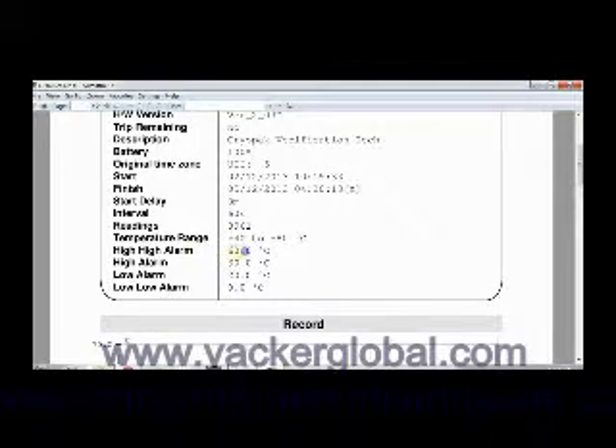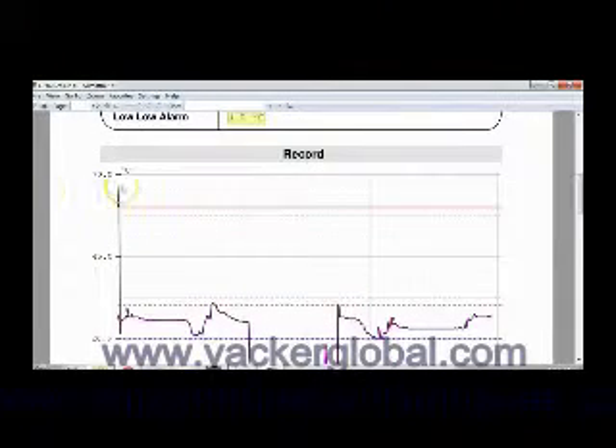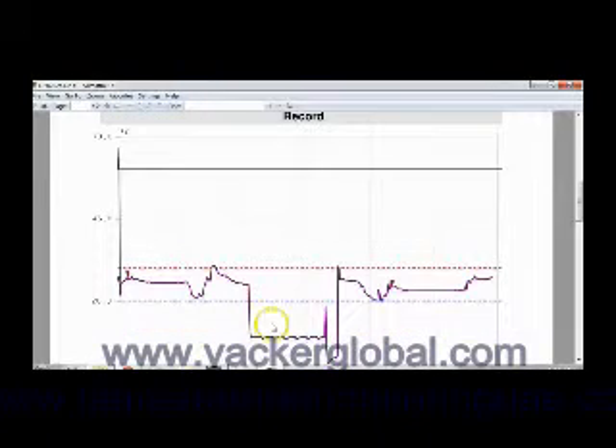As you saw, once the temperature exceeded these limits, the corresponding LED started blinking. Now you can see the graph here, showing the various points at which the temperature exceeded the programmed limits.